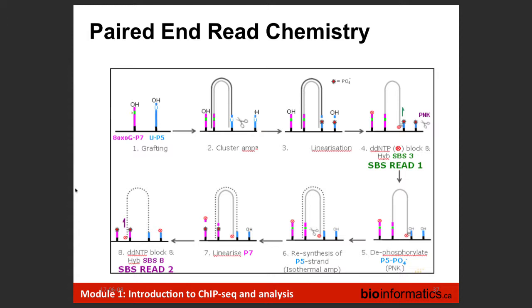Yeah, so mate pairs are not the same as paired ends. If you align a mate pair library using standard paired end alignment defaults, it won't work, because it's actually a ligated fragment where you're ligating together two pieces of the genome that are far apart. This is used essentially for genome assemblies and things like that. It's not used so much anymore because now we have long read technologies such as PacBio and Oxford Nanopore. There are also other strategies now like 10x Genomics, where we're adding indexes and are able to assemble contigs together. So it's not used as much, but at the time it was quite popular, probably 5 or 10 years ago. Anyway, mate pairs are not the same as paired end.